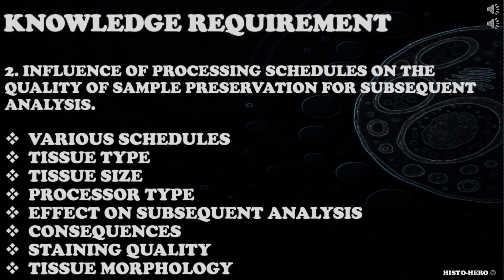You could ask the candidate to name processing schedules they use in your lab, and why, to specify which processing schedules they would use for various tissue types and sizes and why, to explain how processing schedules can affect the quality of the sample preservation for subsequent analysis like H&E, IHC, or molecular testing, and what would happen to the sample if a wrong processing schedule was selected.